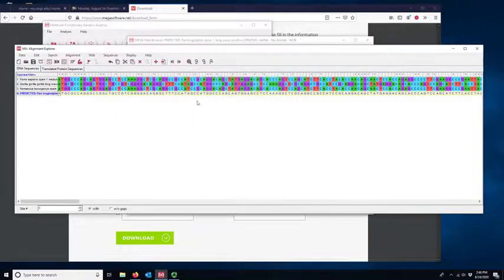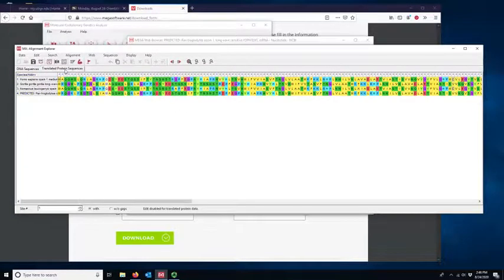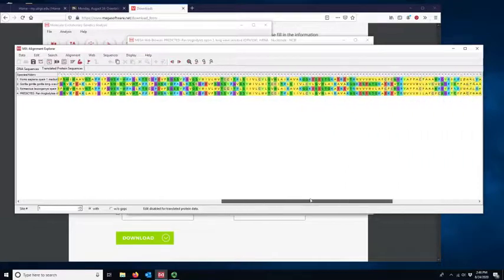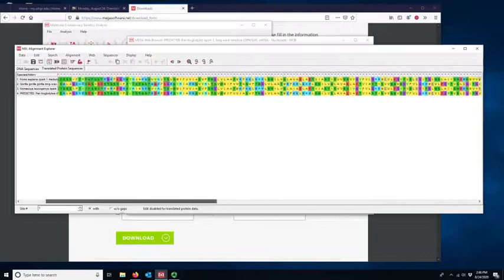And so now I have 4 different DNA sequences, and notice that the alignments don't match exactly. Now, when you are using proteins, usually the best way to do it is to translate them first. I want to make sure that I am completely in the right reading frame, that I don't have any stop codons till the end. And then I'm going to align them.